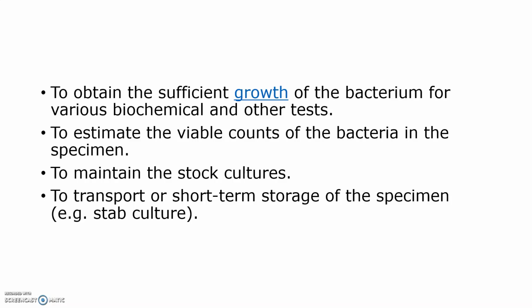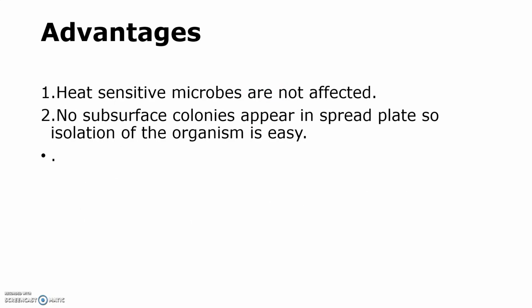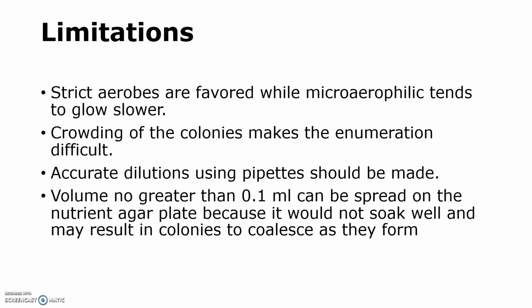Now what are the advantages? Heat sensitive microbes are not affected. No subsurface colonies appear in a spread plate, so isolation of the organism is easy, because they are all present on the surface.